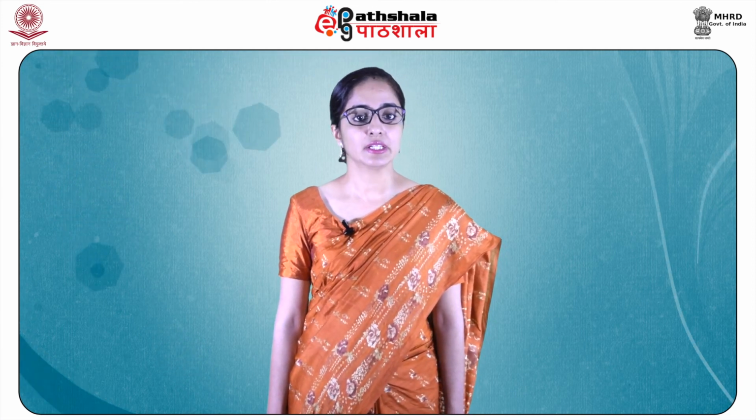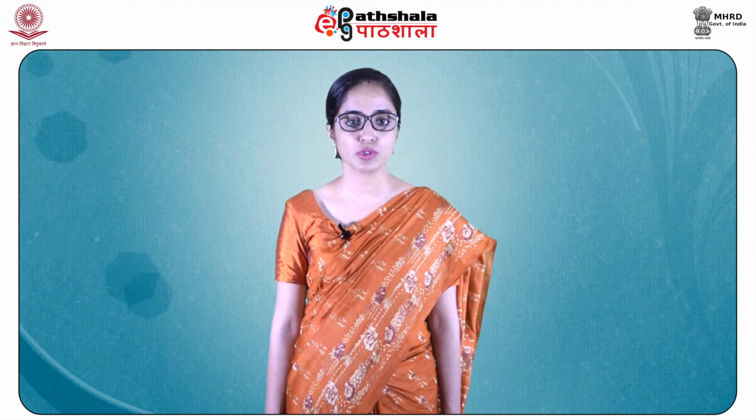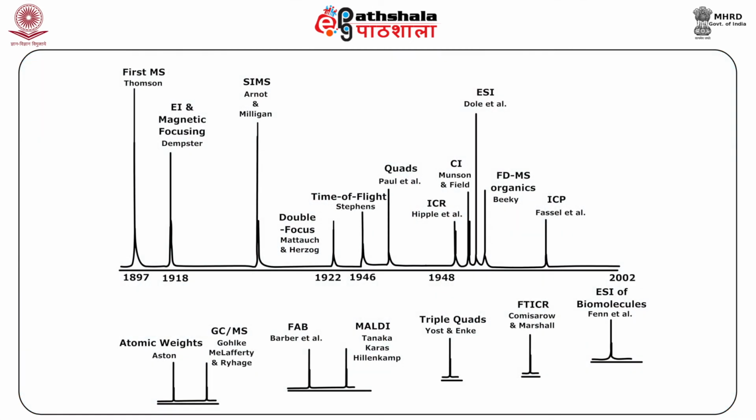The type of detector is supplied to suit the type of analyzer. The most common ones I have already stated are the electron multiplier, the multi-channel plate and the Faraday cup. Now, you can see here in this figure, why I have told you these things again is that it shows you the history behind the development of various mass spectrometer instruments which have been available in the market, and how technology has progressed and shown us better ways of detecting more molecules with better instrument technologies.